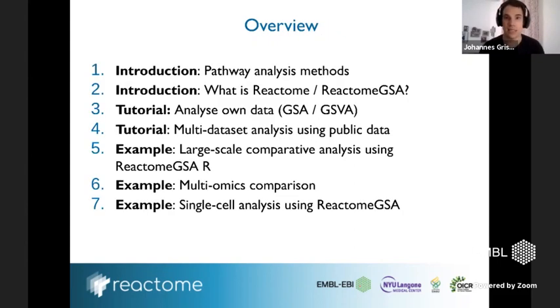Okay, so this is today's schedule. We'll start with 2 introduction parts. The first one is a very general introduction into pathway analysis overall. And then I'll be talking about Reactome and ReactomeGSA just to give you the context, and then basically it's just tutorials. So I'll show you how to analyze your own data. This has been a huge question over the last year. We've had a lot of support questions using 2 methods, the Geneset analysis and the Geneset variation analysis. And then come the examples.